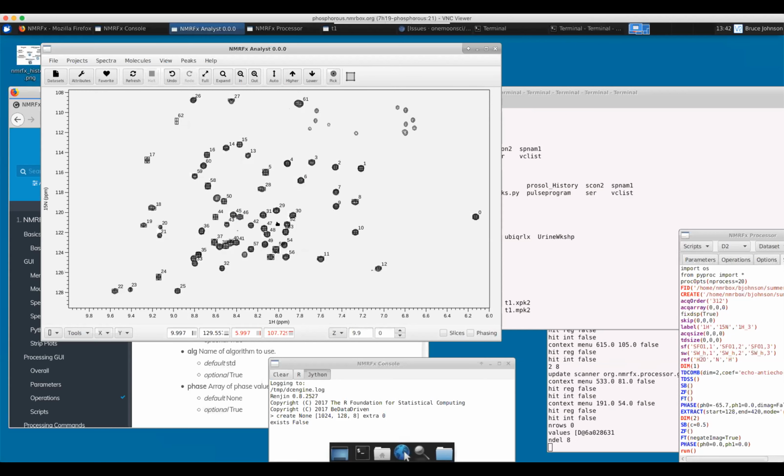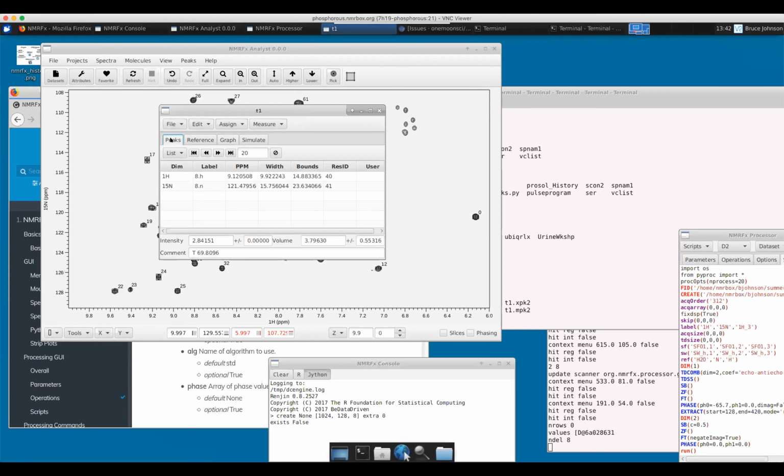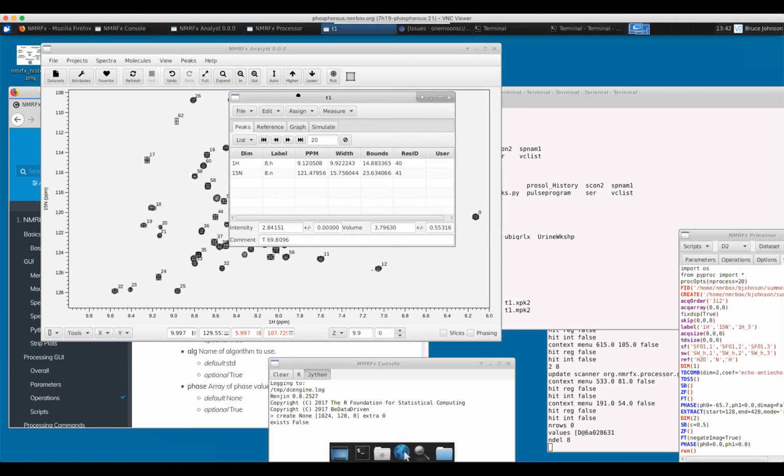Let's do that fit planes, see what happens, and then let's go look at our peak tool. It is actually written, and because the counts weren't right, it's written in this comment. That's the fitted parameter, because now we only have a single number that we fit across the whole column, that relaxation rate or time. For that to make sense, it would depend upon having the counts converted correctly, or as you say, if it was a linear multiplication, you could just translate this number.